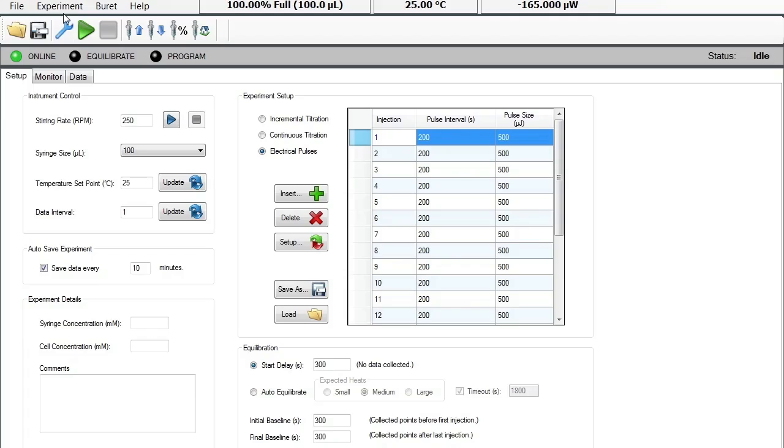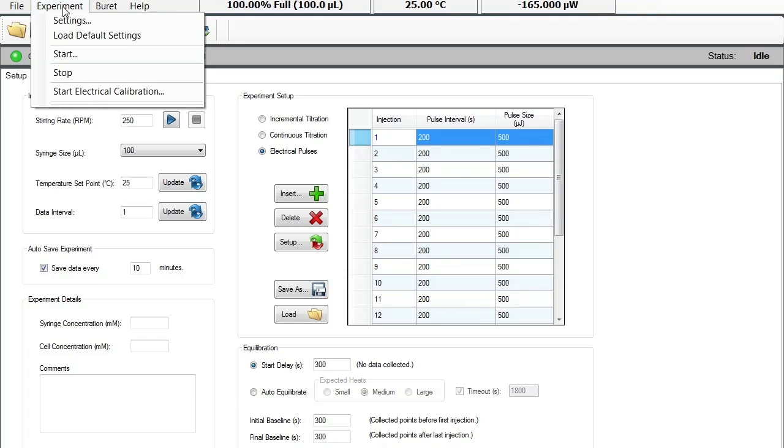Then we will open the ITC run software and come under the Experiment tab. Once here, you will click on Start Electrical Calibration.